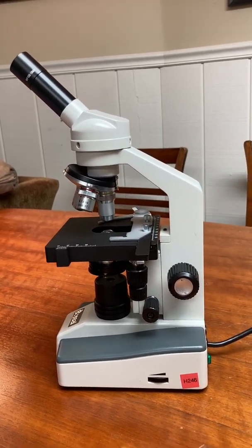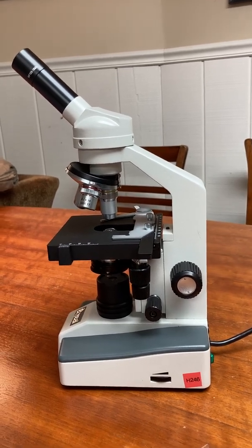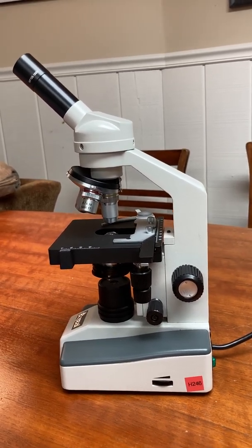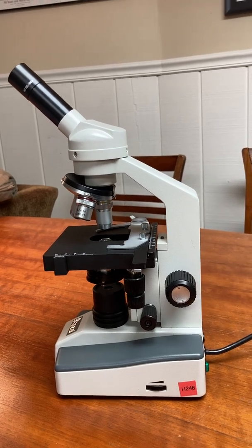Now I'm going to go through these structures according to the list in your lab manual. So we start with arm and base. I've already covered those and I've covered the lamp.